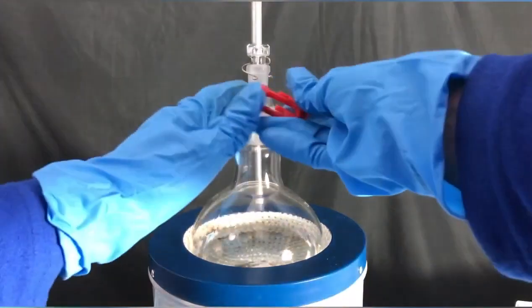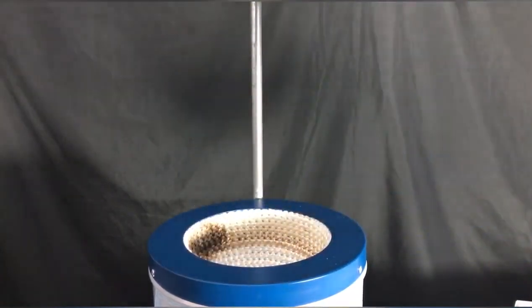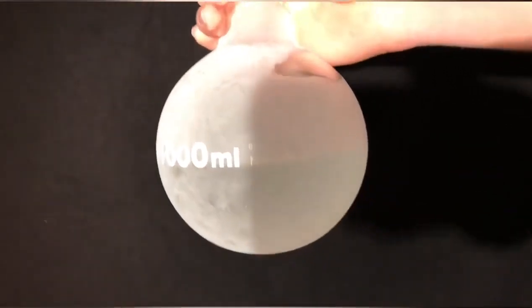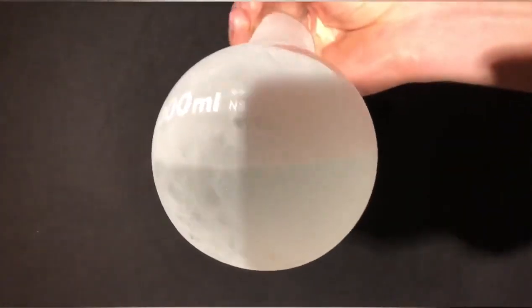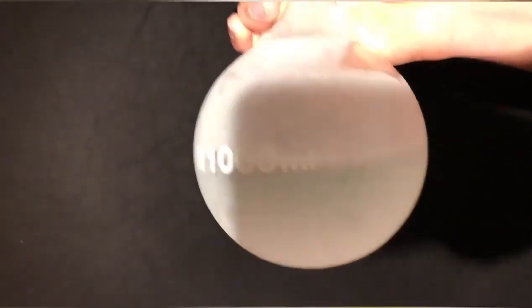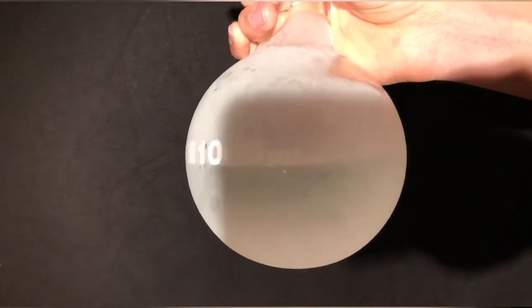In theory, the barbituric acid should simply crystallize out during this time, but in our case it turned out not to work like this. Sadly, even after a week, no barbituric acid had crystallized out of solution. Therefore, this will be the topic of another video, and you can definitely stay tuned for this because I will find a way to squash every gram of barbituric acid out of this solution. So stay tuned for part 2.